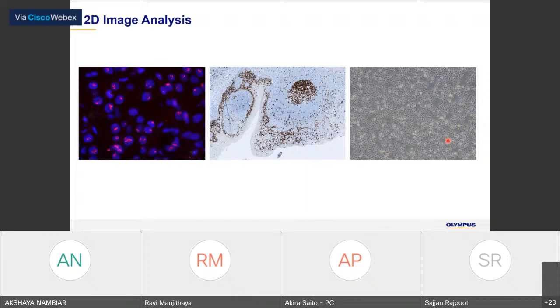But anyway, the point you need to understand is that you need to use the observation method which can detect or make the contrast that you would like to see, or maybe would like to analyze.